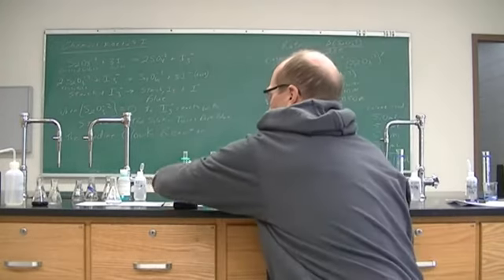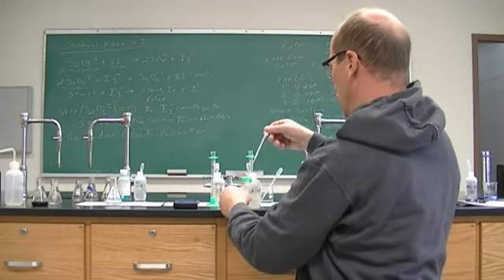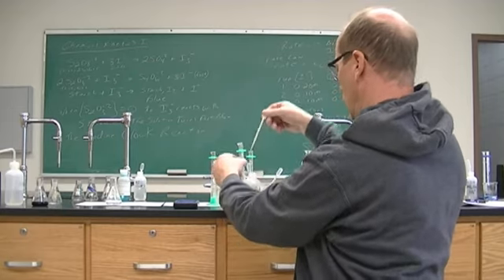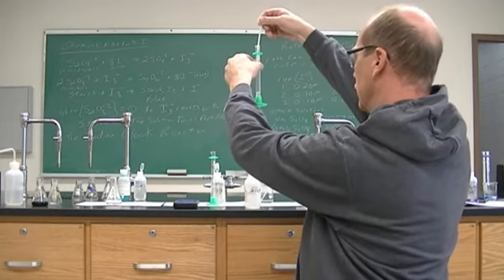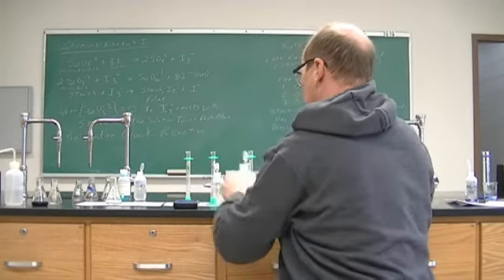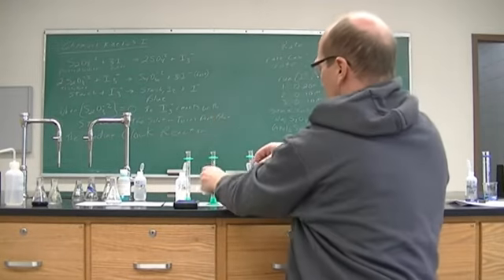I'm going to prepare for run 3. Three mils of starch. Five mils of the S2O3.